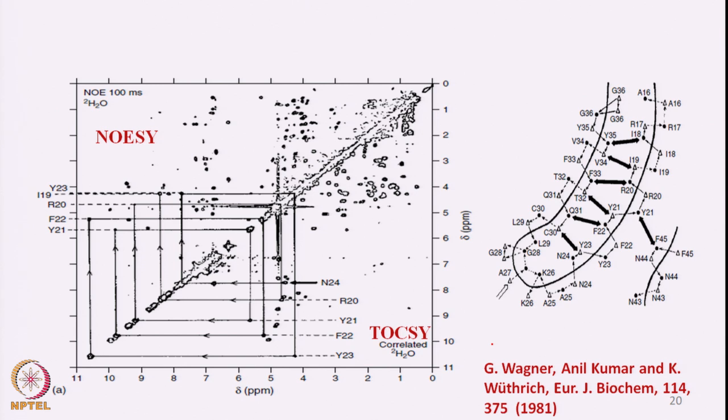model. So, now I identify that if you look at the NH-H alpha correlation, it is happening in the backward direction, right? Backward means 8 is showing correlation with 7, 13 is showing correlation with 12, and 18 is showing correlation with 17. That is how we can look at these kinds of correlations we are seeing here. So, this helps us in building a model of how the NOESY peaks will be assigned.